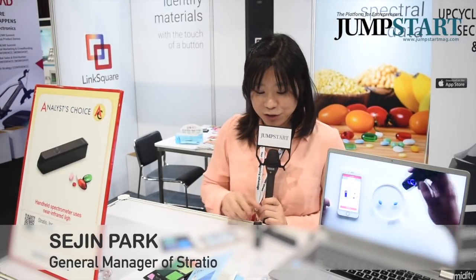Hello, my name is Seijin Park from Stradio, and today I'm here to introduce our product. It's called Link Square. It's a spectrometer that can distinguish different kinds of materials. You can easily distinguish a real one from a fake one, and we can also let you know the freshness of the meat.